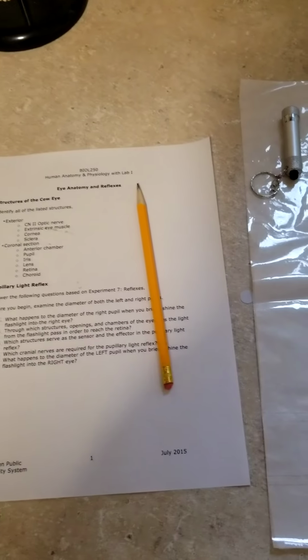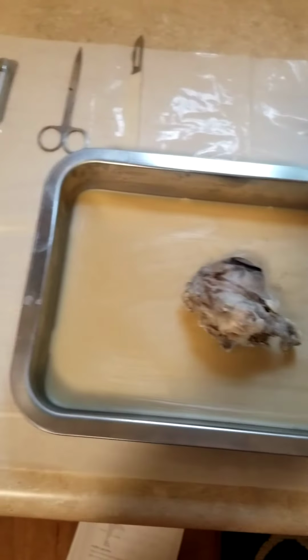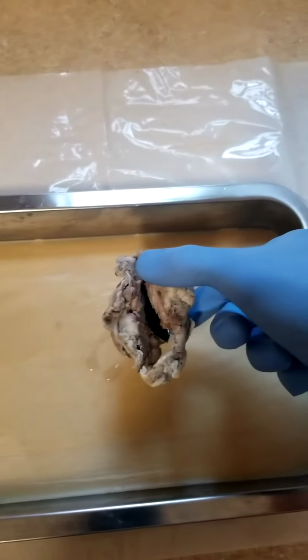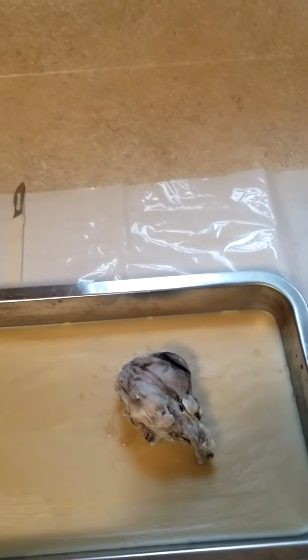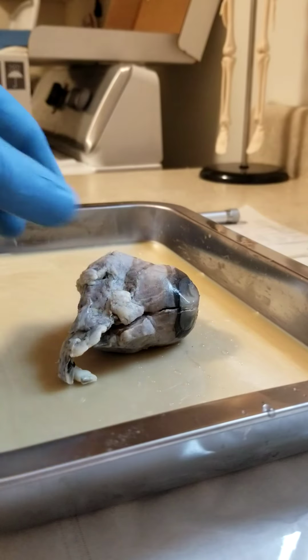We're going to be going over the structure of the cow eye. I'm going to show you my setup here. All I have is my handout provided, flashlight, a couple of tools, and then the dissected cow eye that we're going to be discussing. I don't have a lab assistant with me today. Just pause it for 1 second, get it set up. All right, hopefully this is a pretty good angle here.